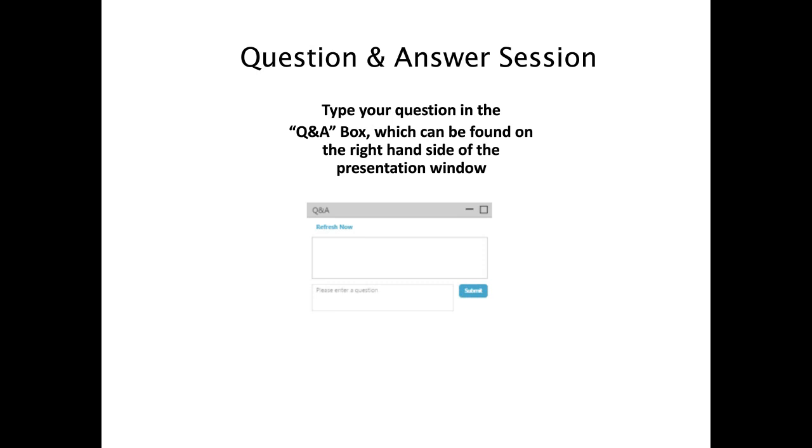If you don't have the computer software for optimizing, you have to use variants of the initial and ending gradient compositions, as well as the gradient time to iteratively come to an acceptable solution. And you can always then try a little bit of iterations above and below those values and see what happens to your separation when you change them slightly, which is what you do in a method robustness type of test.